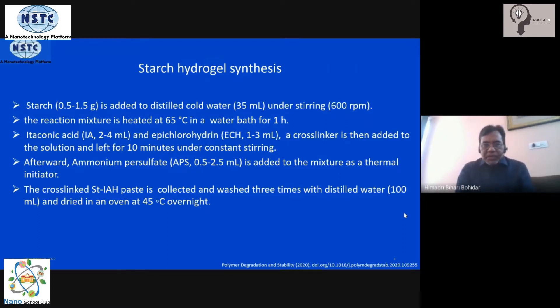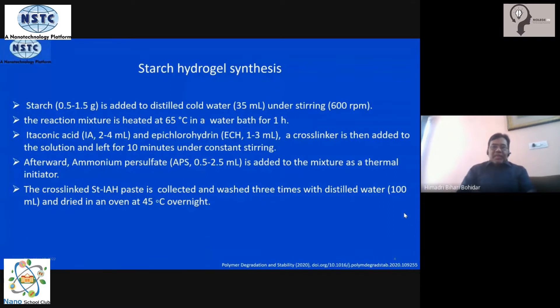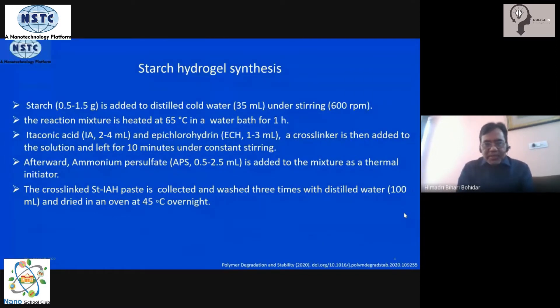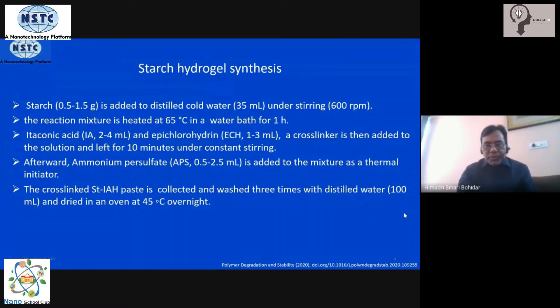The cross-linked starch and etaconic acid is received as a paste at the bottom after the reaction, which is washed multiple times with fresh distilled water and dried in the oven at around 45 to 50 degrees Celsius overnight to collect the material. The material is then ready for use.